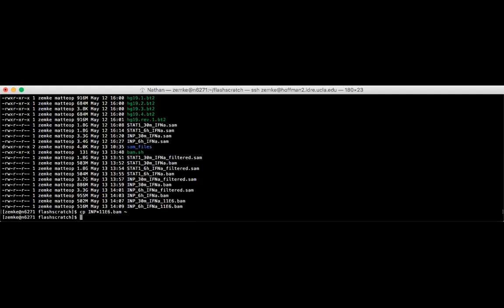To stop a command, sometimes it's Control Z or Control X or Control C. On PCs versus Mac, on Mac, usually in terminal, it's Control Z to stop a command, and on PC, I think it's more typically Control C. I don't use a PC, so I'm not positive on that. Different programs use different ones. Sometimes a program will require Control X or Control Z or Control C. I'm not really sure why. I just try one, and if it doesn't work, I try the other.